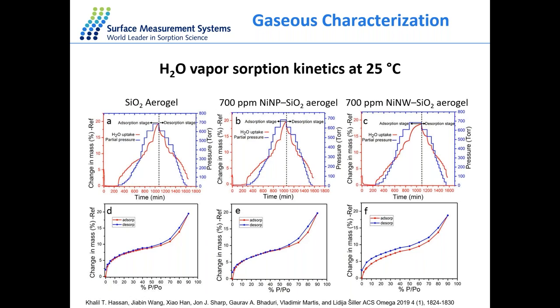All vapor adsorption isotherms indicate high interaction between water vapor molecules and the catalysts. The adsorption process can be described by water adsorption on surface functional groups, followed by the formation of clusters of water molecules on existing water molecules, and pore filling around 50% P/P0. When the pressure is high enough and the pores are completely filled, a plateau is reached. We also observe formation of hysteresis loops for all three samples because of capillary condensation and formation of irreversible hydrates.